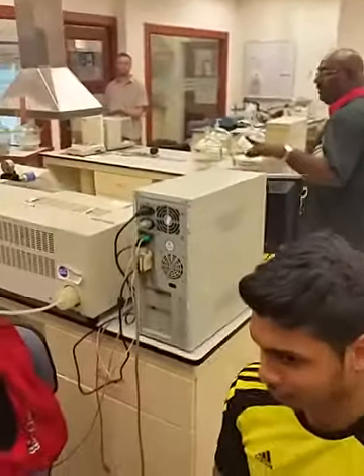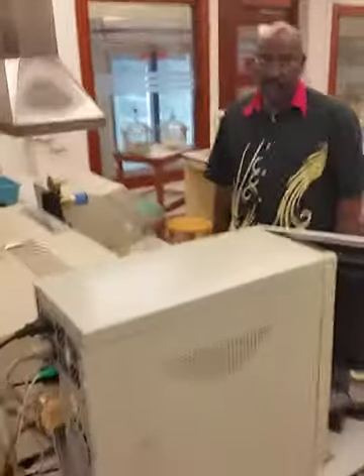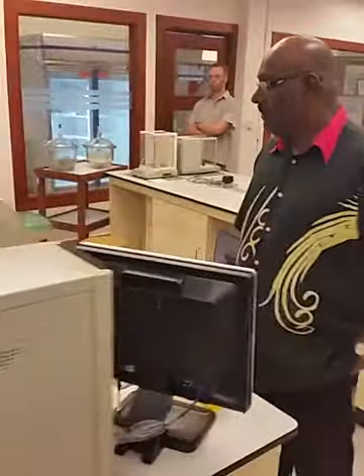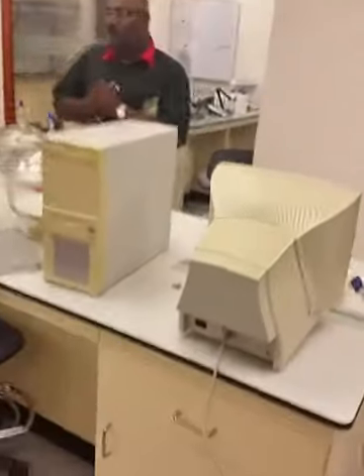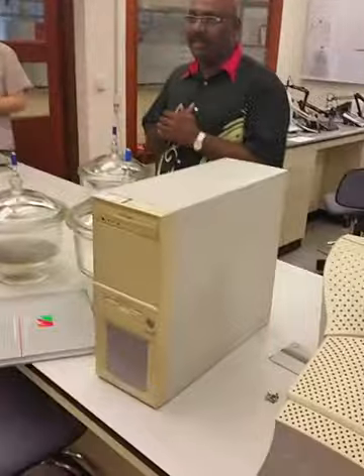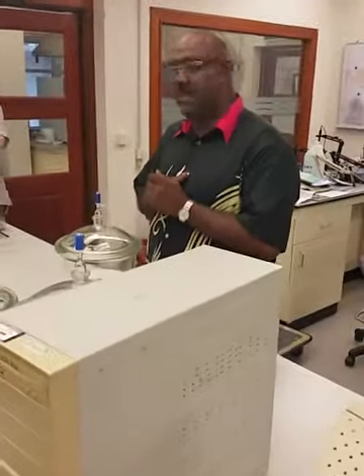This one is a direct mercury analyzer, specially dedicated for mercury. Direct. You can use solid or liquid. Solid and liquid only. The analysis method we are following is the APHA method, the American Public Health Association method.